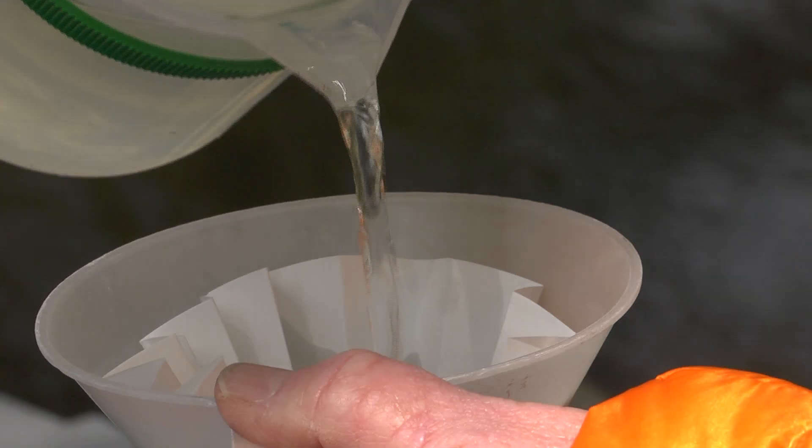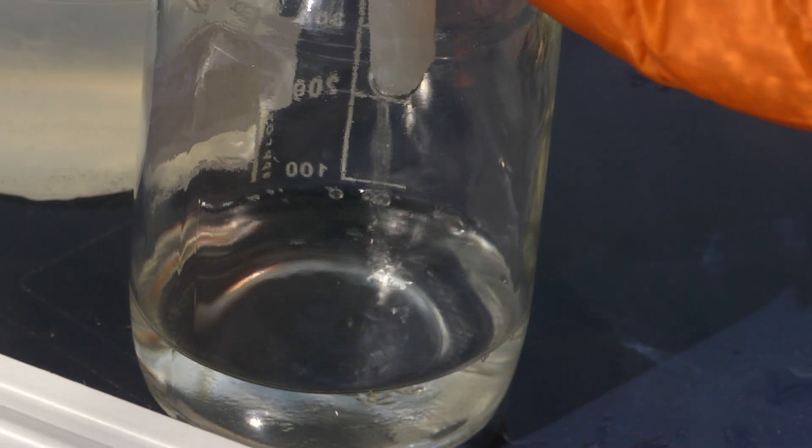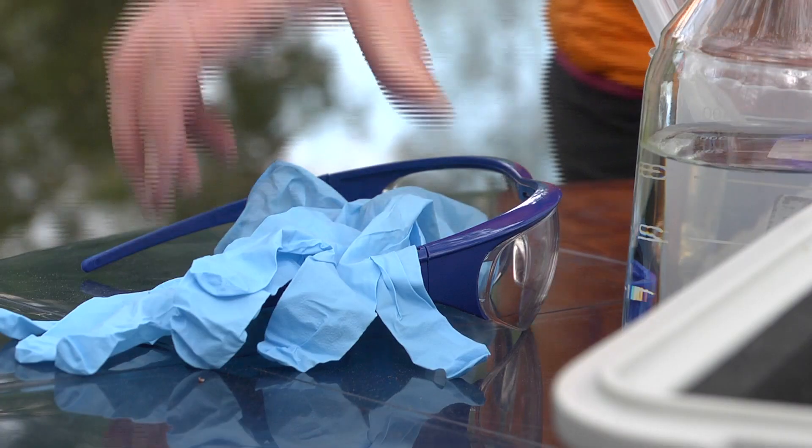In situ, it is enough to filter the sample using a fluted filter to remove suspended solids. Suspended solids would affect the subsequent reading because of settling behavior or scattered light effects.